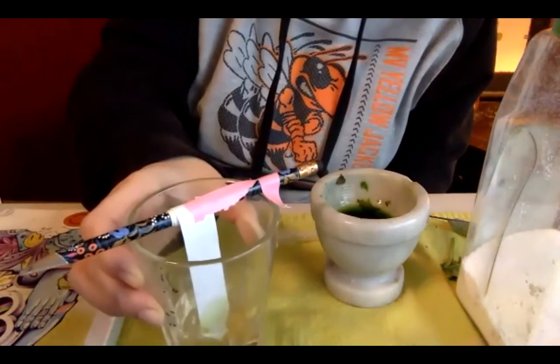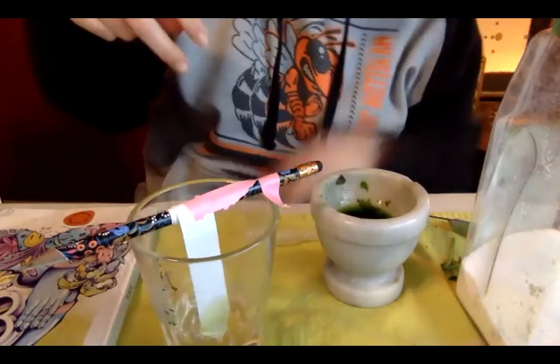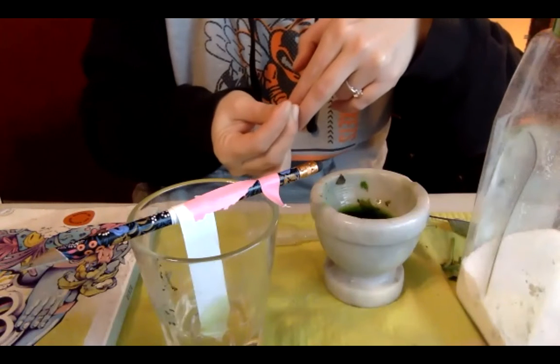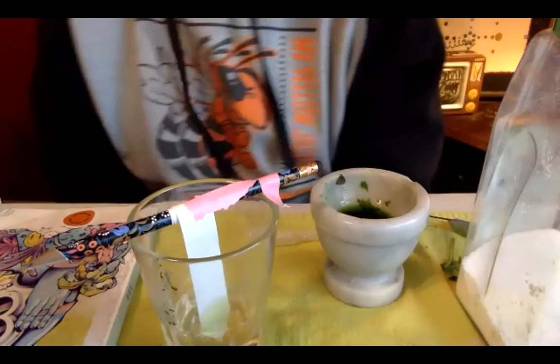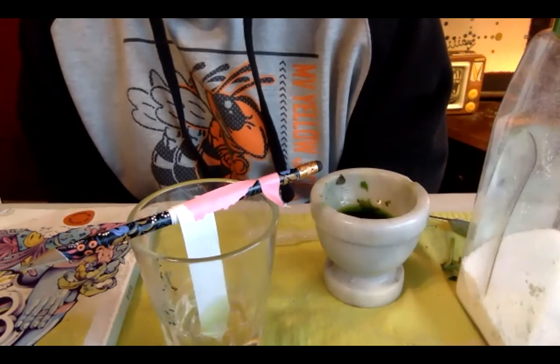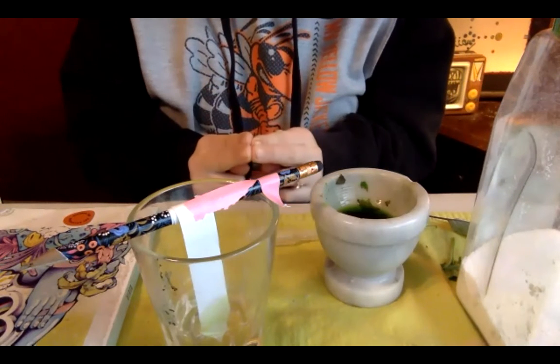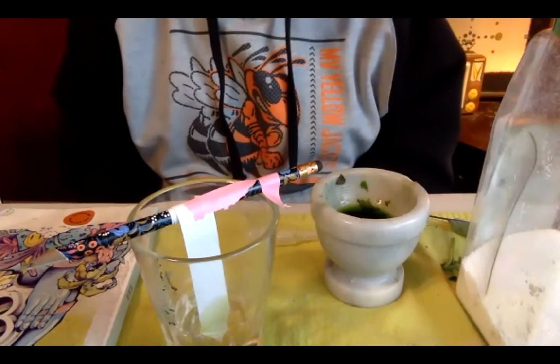Again, you can just take a coffee filter and cut it into this kind of shape. It doesn't even have to be that pointy shape at the end. The pointy shape just helps you concentrate where the solution is coming through. Sometimes you'll see, in a minute, how you want the smallest point of contact between the paper and the solution because you don't want the pigment to leach back into the chromatography solution.